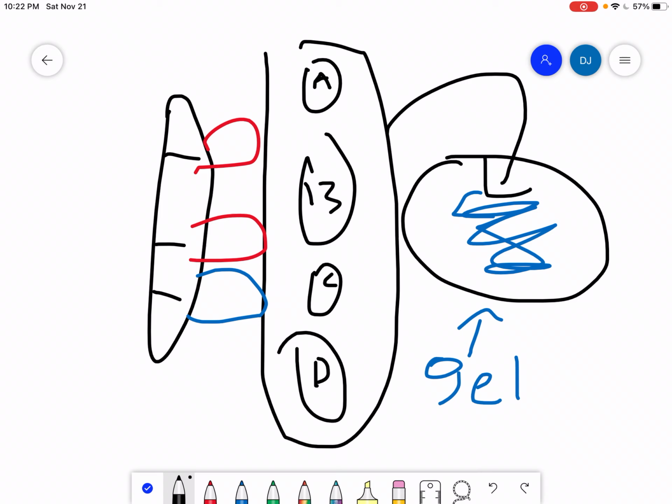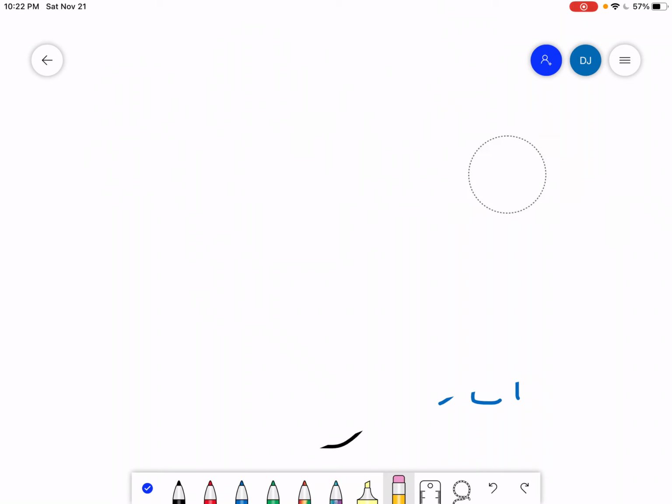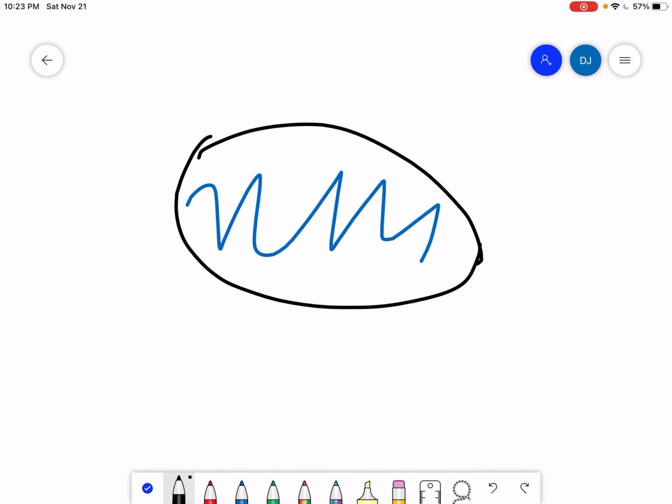Well, look, what we can do is create this. So let's just say we erase this. Let's create the new product. We have this gel over here, and we have our fragments, right? Let's say this was a B, in no order. I don't really care, but we're trying to find B, right? So let's say this is the product.